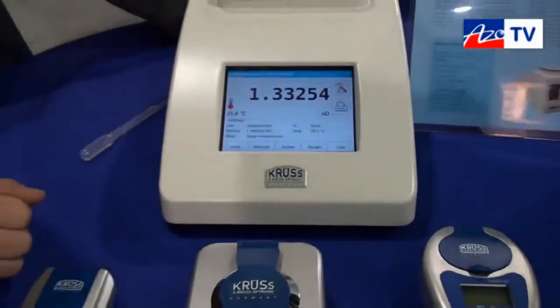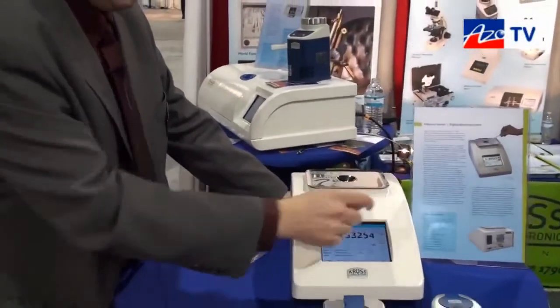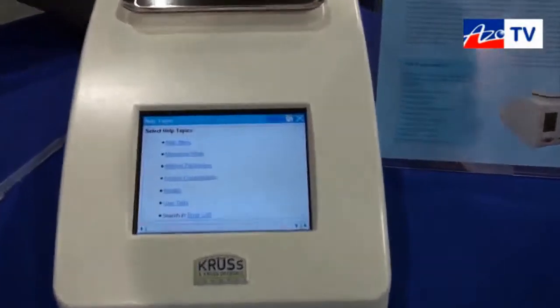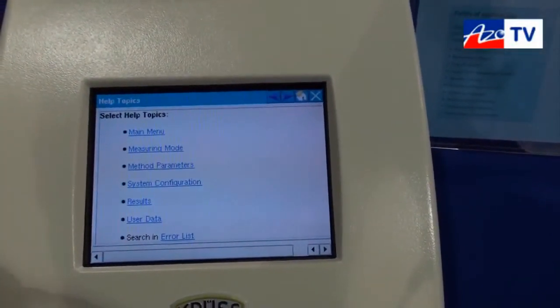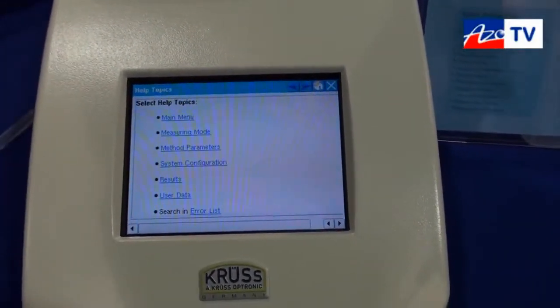As you can see, it's very easy to use with the touchscreen. There is also an on-screen help feature. If you need a little help, you can find it here — it's written as a short manual. So if you don't find your printed manual, you have a little help right here.